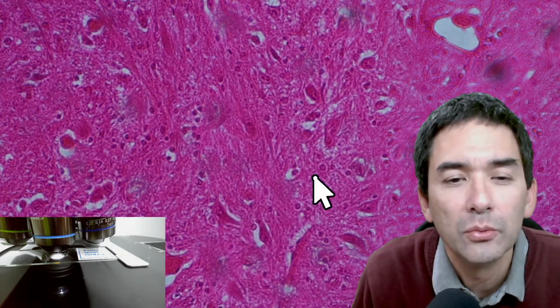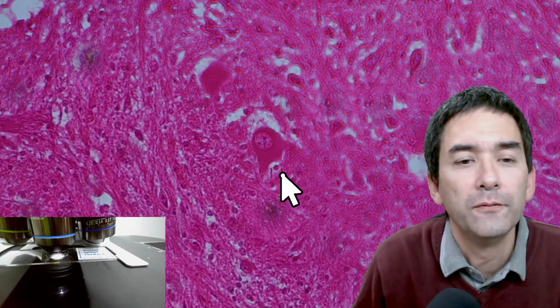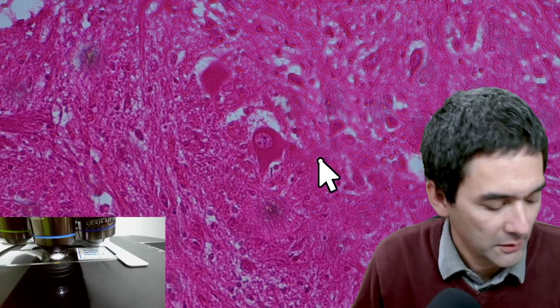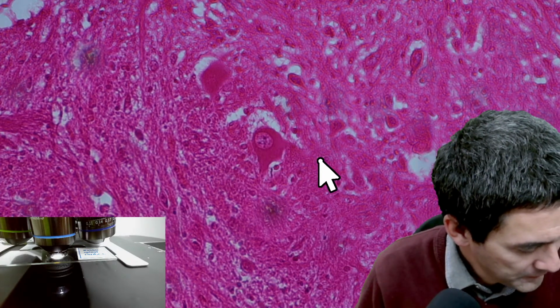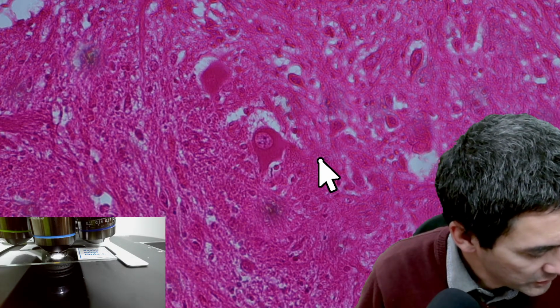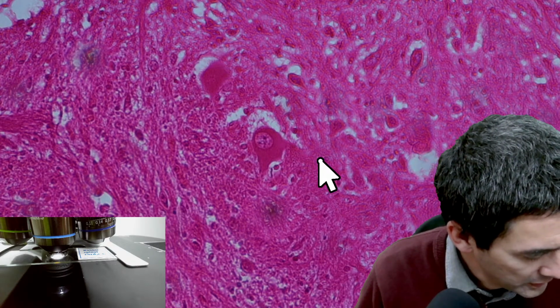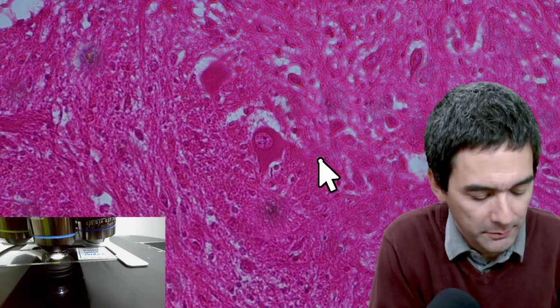Possibly that some of these are nuclei, but again, I would say it's difficult to see. So, do I have something else here? Dog cardiac muscle was not so good. The motor nerve, skeletal muscle, human blood smear. Let me see if I have something here in the other box.